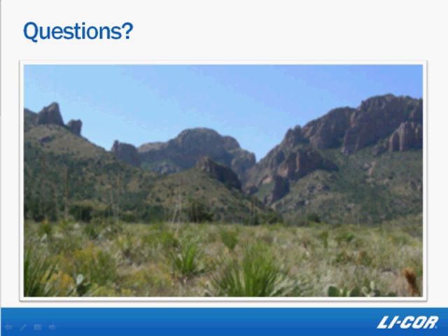Great. The next question is, do I need to log multiple times for survey measurements? Yeah, we see this a lot in data files. People will be clamped onto the same leaf and they will log 4 or 5 times, maybe 10 seconds apart. And actually, I was trained to do the same thing, but you don't really need to do that. The default settings in the 6400 XT is for a 4-second running average of any data point that you see. So anything you see on the screen or see in the log file, that's a 4-second running average rather than just a moment in time.